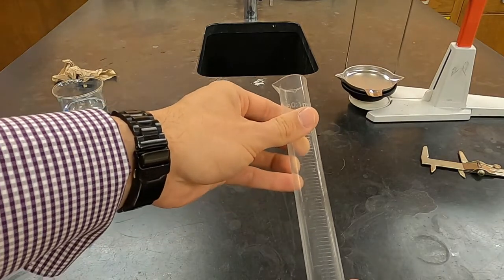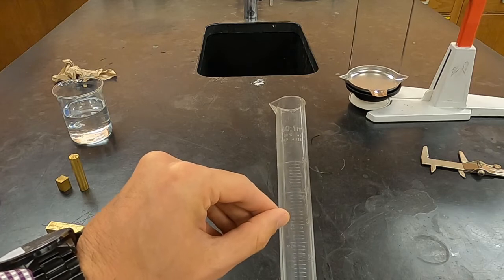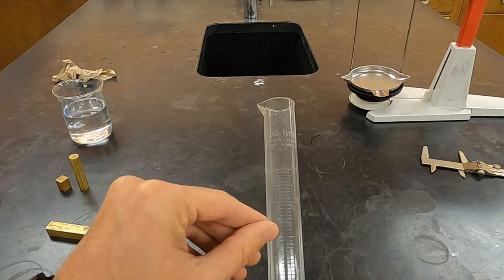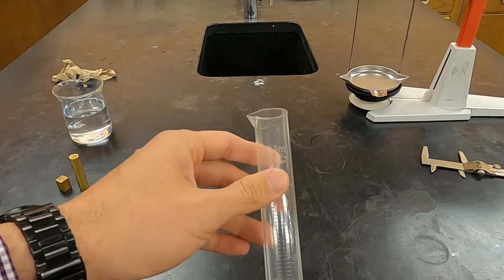It'll still give you the same amount of precision because each marking here is worth 1 milliliter, which means that all of your measurements will go to the tenth of a milliliter. All your measurements should have 1 decimal place in this. Thanks to Hiba for letting me use her 50 milliliter graduated cylinder today.